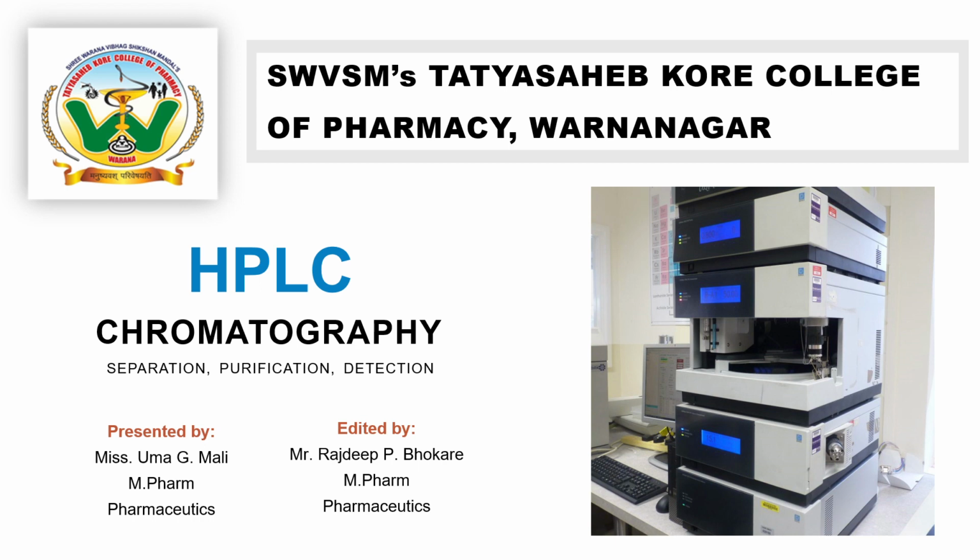Today we are going to discuss HPLC. The topic will cover the introduction, mechanism, working, principle and applications of high performance liquid chromatography. HPLC is an abbreviation for high performance liquid chromatography. Chromatography is a technique for separation. A chromatogram is the result of a chromatography, and a chromatograph is the instrument used to conduct the chromatography.